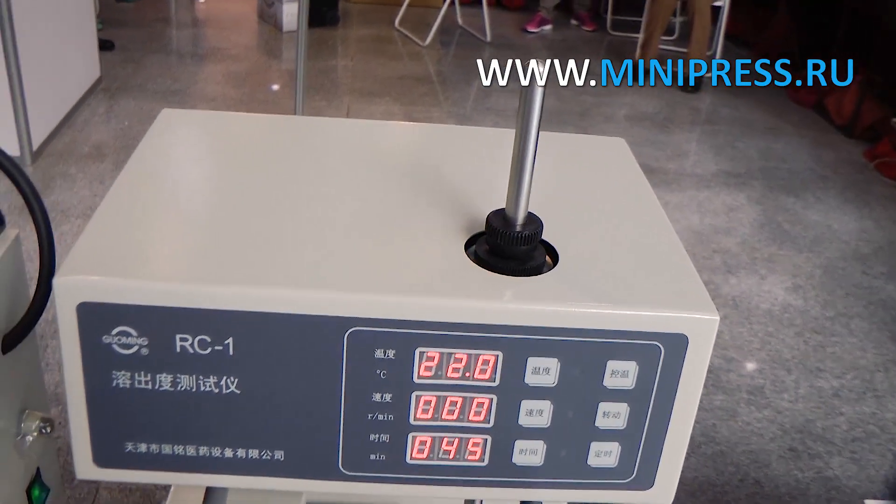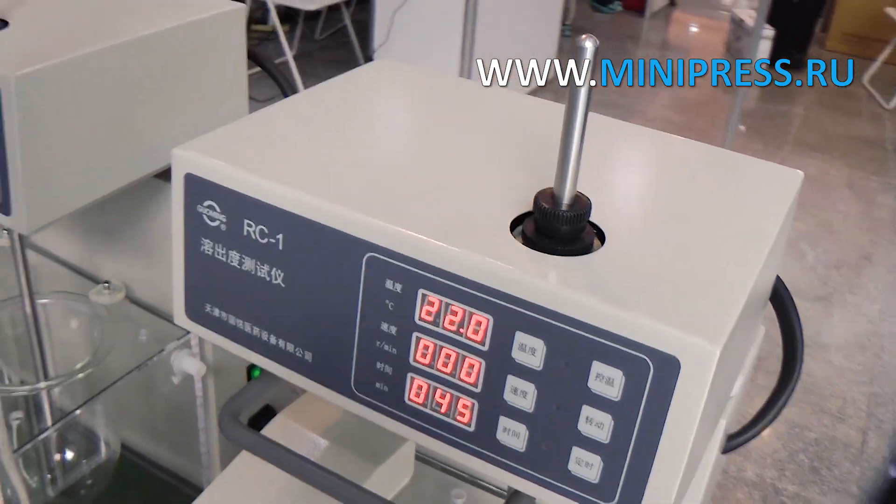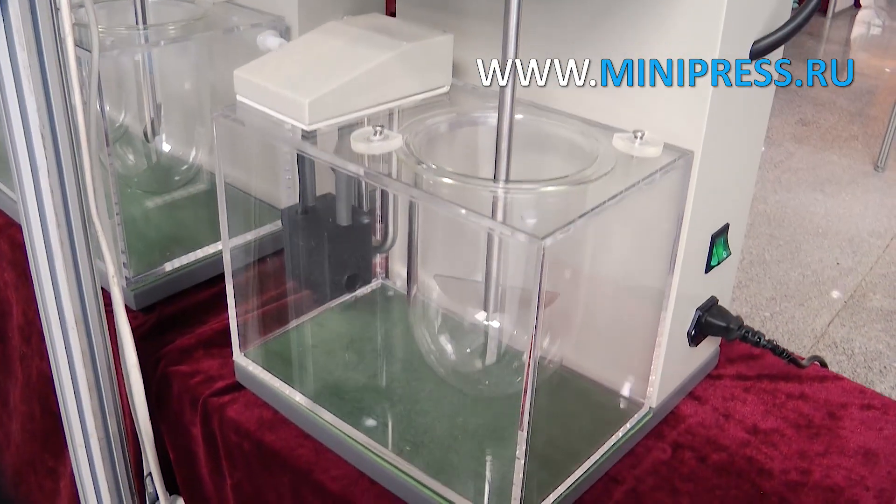It has one reservoir and one paddle arranged in one row. The main parts of this equipment turn smoothly and flexibly. The tank and blades are made of stainless steel SUS 316L.